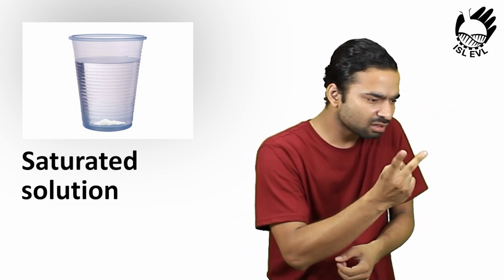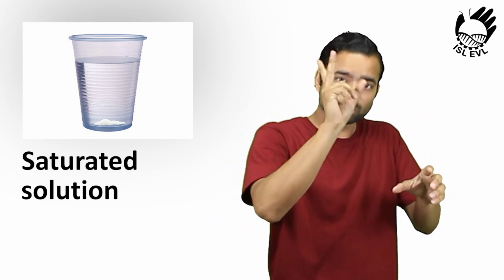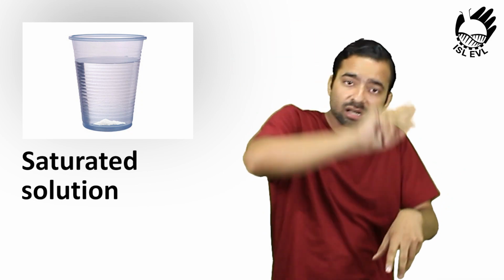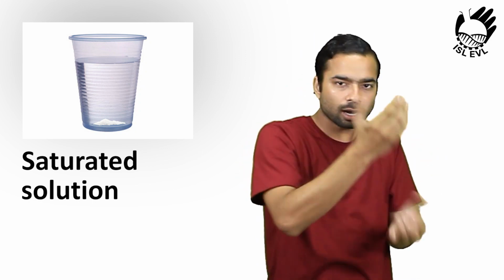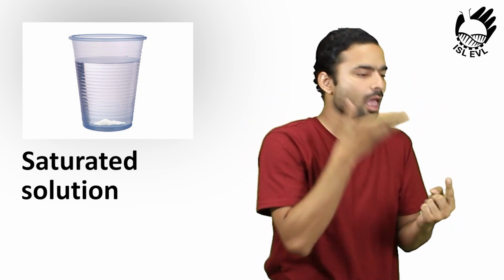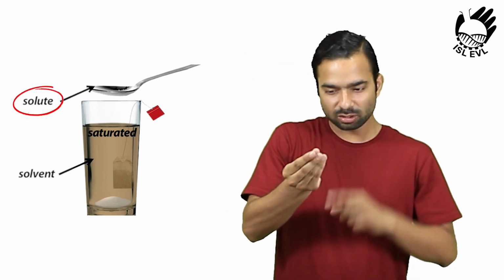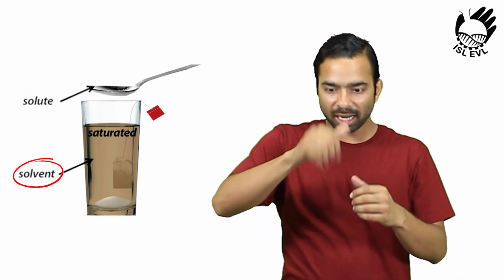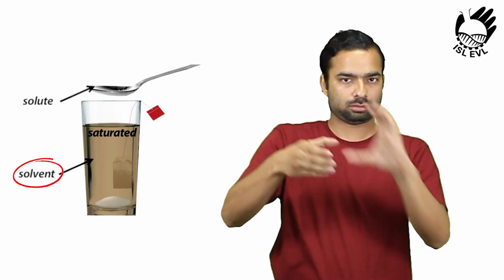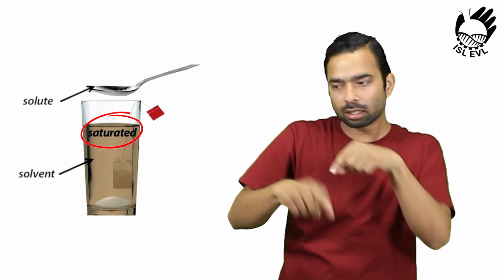To make a saturated solution, once we have chosen our sample, we will need to carry out the experiment 3 times to obtain an average and record our observations. After following this experiment thrice, what we will find in the end is that the sample is not dissolving anymore at the same temperature. While doing this experiment, we will all need to write our observations in the worksheet provided.